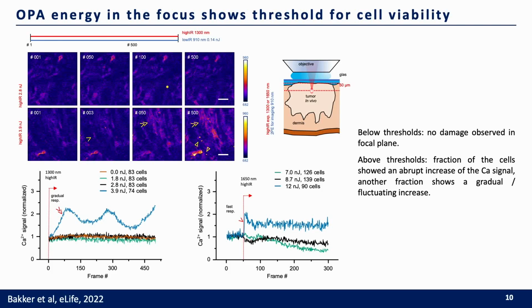Using high pulse energy for high IR excitation has pros and cons. On one hand, it enables multimodal excitation, but on the other, it can also cause physical damage, toxic reactive oxygen species, and photobleaching. The heat buildup can also lead to phototoxicity.